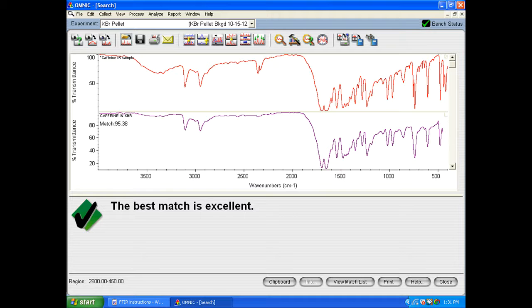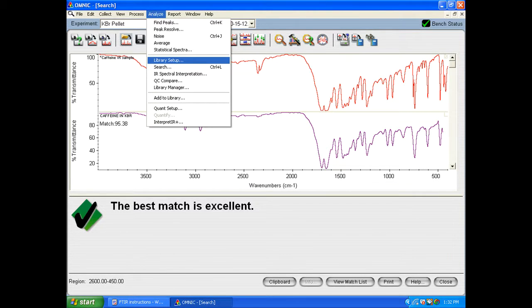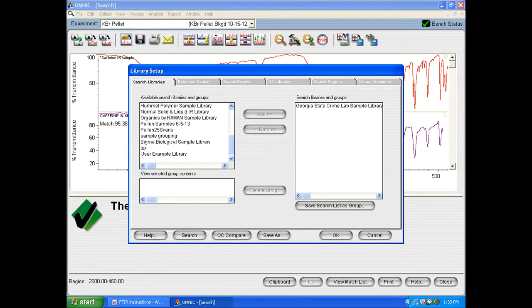If you were to go to library setup under the analyze tab at the top you could choose different libraries to try and search from. For example they have the normal solid and liquid IR library. So this is just a library that some outside people have compiled together to help people identify what their substance is. And so we could choose to search in that or to search through other libraries for a possible match from our sample IR.